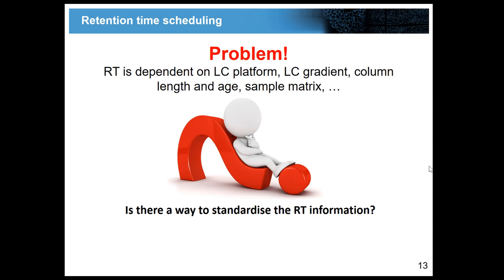So it doesn't make a lot of sense to store knowledge about your peptide retention time, like it's eluting at a certain minute. So what can you do? Yeah? Create a tool. Here we have it. Internal standard sample, and check every time, because you are running like 4-5 days, what is the real retention time? And you can change it. Yeah, it's a very good point.